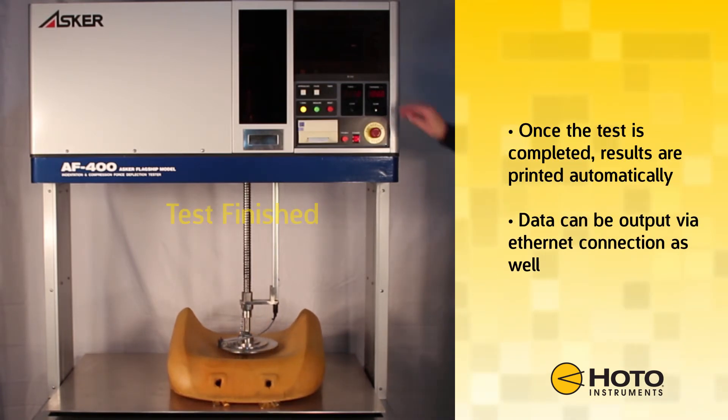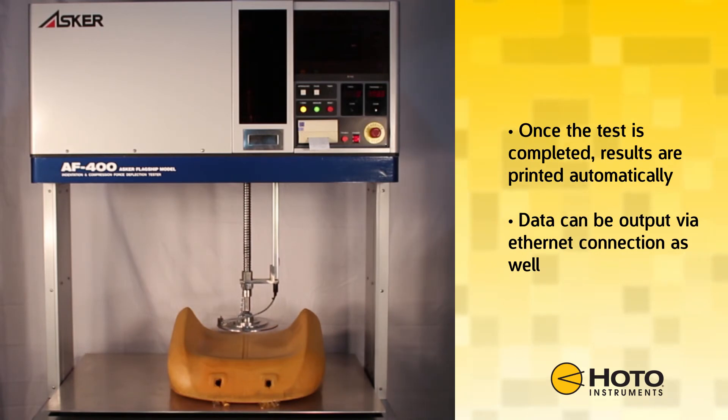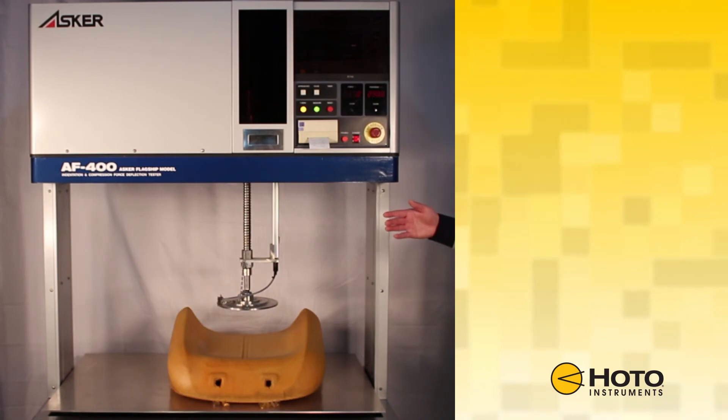Once the test is completed, results are printed automatically. Test data can also be output via Ethernet or RS-232 connection.